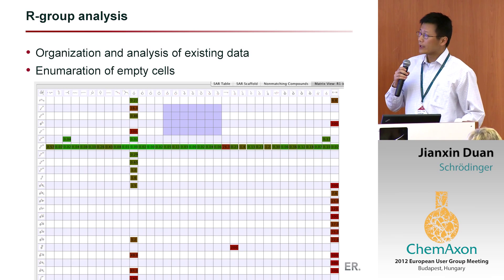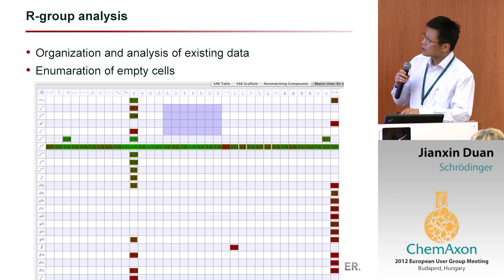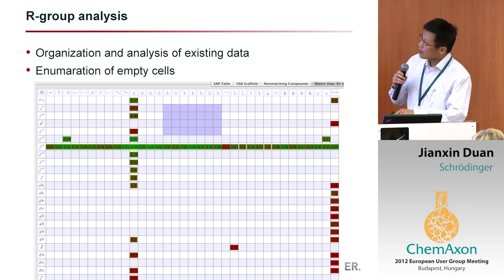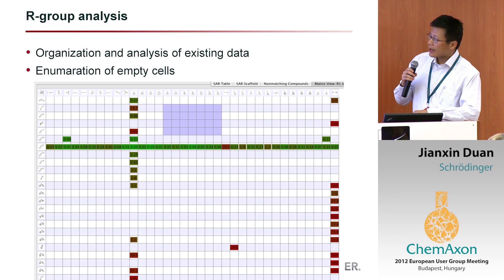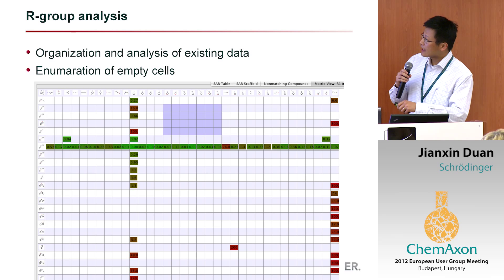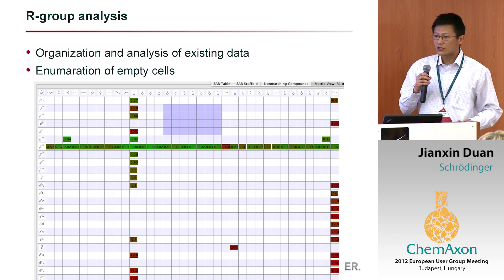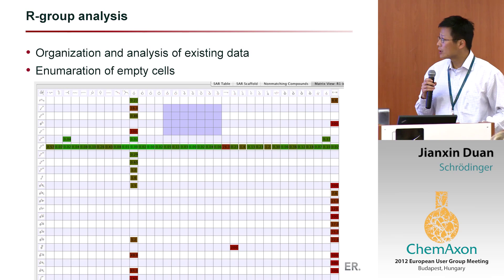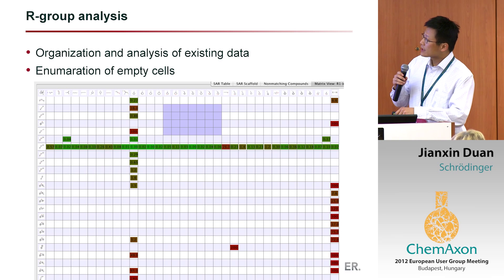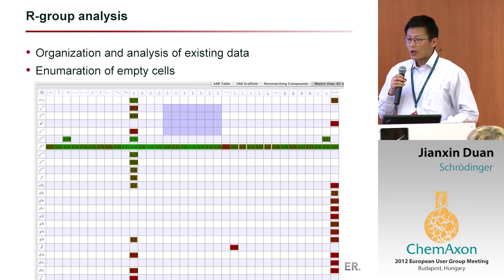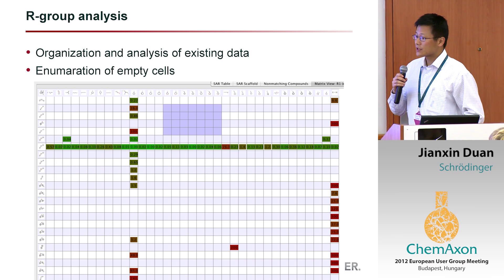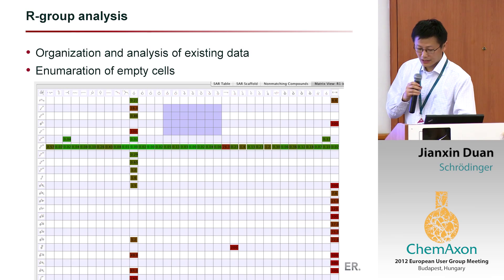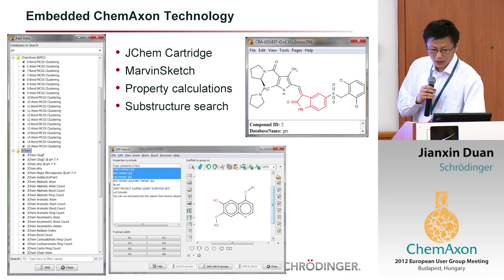This is for SAR — suppose you have a core structure with R groups. You can quickly visualize which compounds you have and what their activities are. With the colors, it's easy to pick out hot spots or cold spots. You can also select the empty cells and say you want to generate in-silico molecules for those combinations, and explore those.